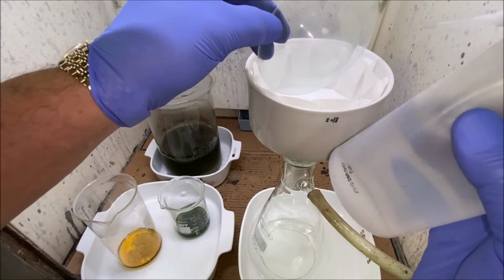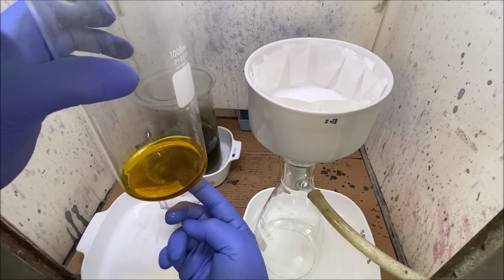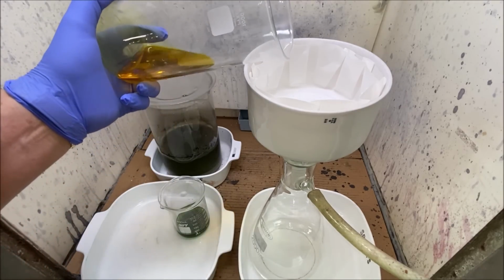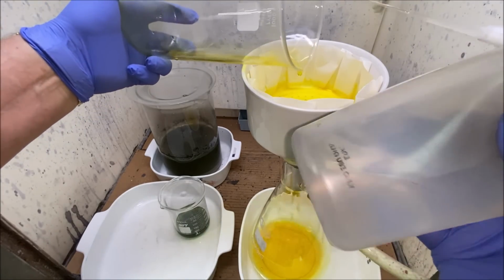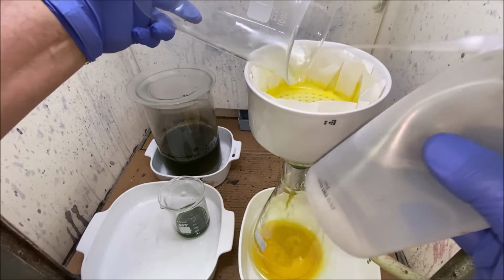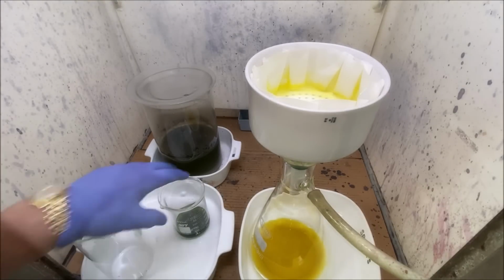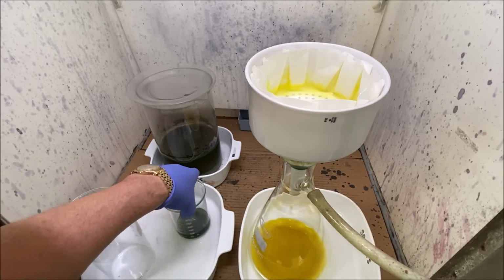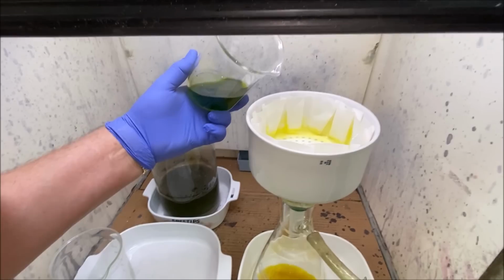I'm going to choose the least likely to clog my filter to go through the filter first. This is our button that we parted with nitric and then dissolved in aqua regia. We'll pour that through first. Here we go. Next, we're going to pour through the beaker that had our little bits of metal in it. The reason I'm choosing these two is because they have the least amount of solids in them. So let's go ahead and pour this in now right quick.